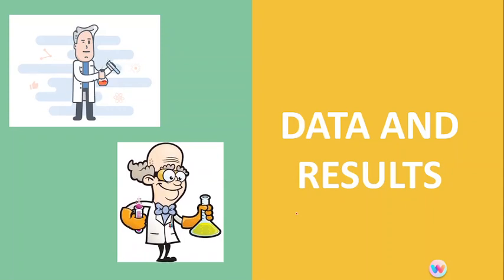Now, let's move forward to the data and the results. Sa ating discussion, i-discuss lang natin yung computation on your worksheet and then yung mga na-observe natin na pH and then the classification based doon sa experiment na ginawa natin.